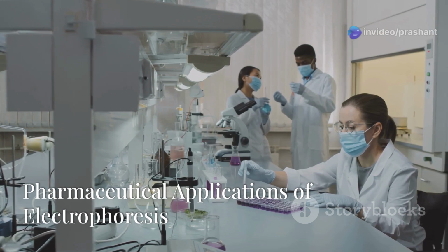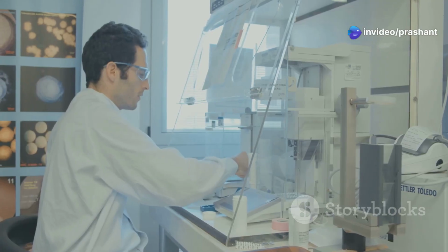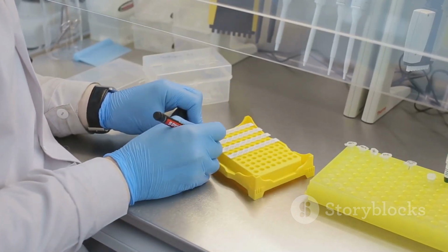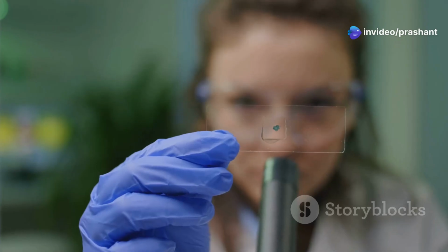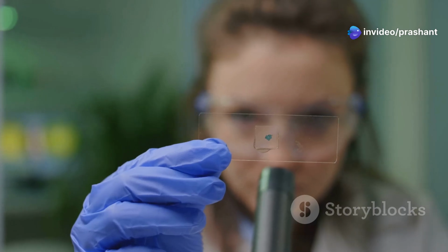So, why is electrophoresis so important in the pharmaceutical industry? Here are a few key applications. In drug development, electrophoresis helps scientists understand protein binding, drug purity, and stability. It's also crucial for analyzing biosimilar drugs to ensure they match the original product.